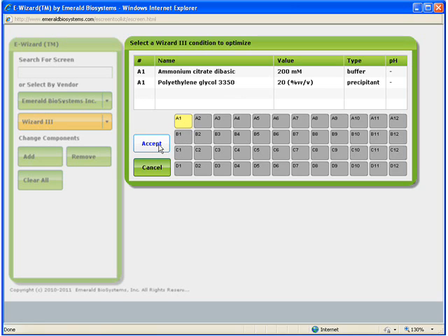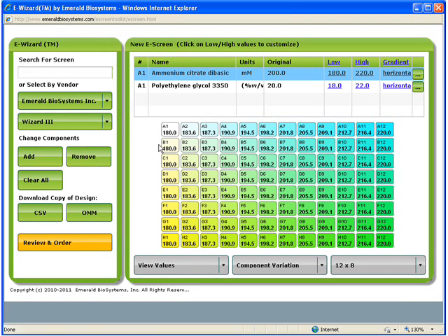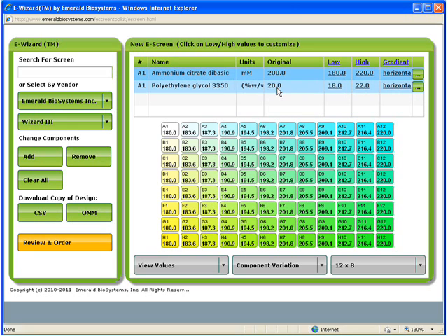Once the desired condition is selected, click Accept, and a default optimization screen is automatically designed based on the initial concentrations and pHs of the original components of the condition. At this point, I can simply accept the design and create this screen using the OptiMatrixMaker, if I am happy with it.